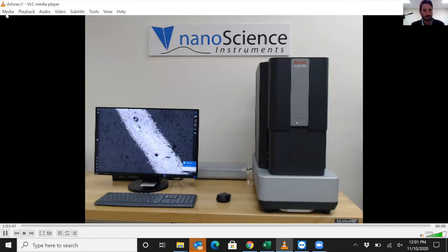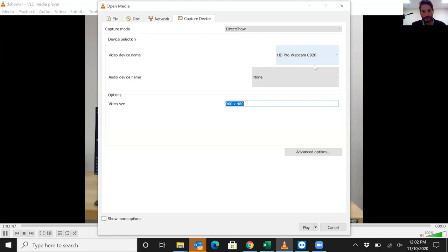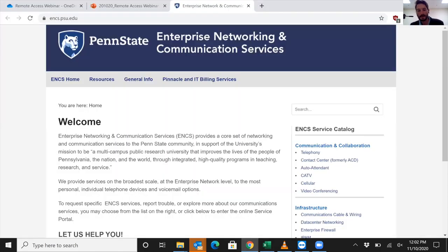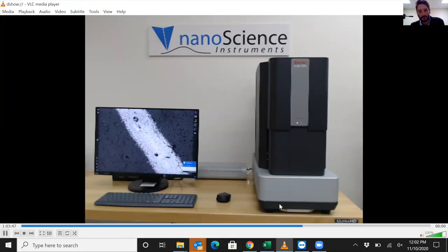What vacuum level? Yeah, so we're working in the 10^-7 range at the source. And then in the imaging environment, we're typically at about 1 pascal. So trying to get this camera to work. Maybe it won't work, but 60 pascals in the imaging environment to about 1 pascal for a high vacuum mode is the rough vacuum levels.